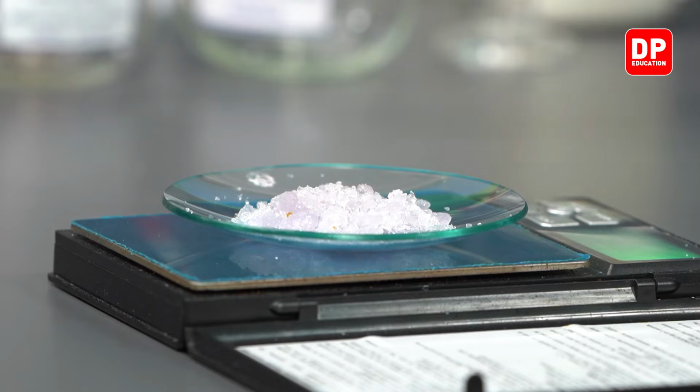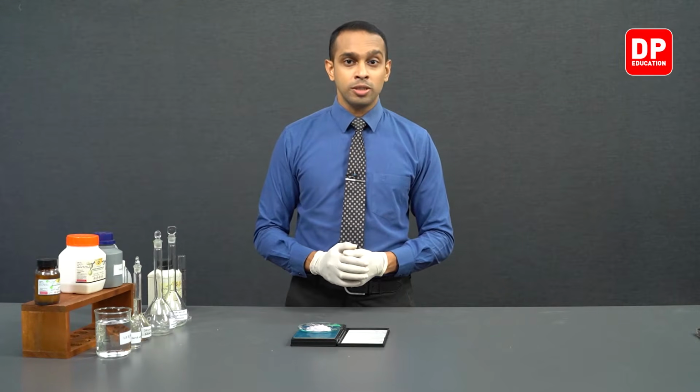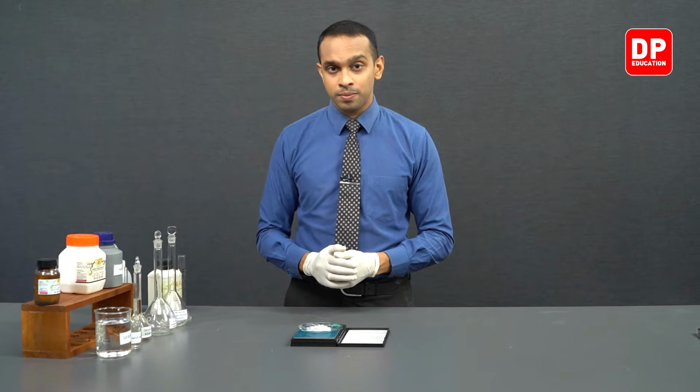So we are going to dissolve this ammonium ferric sulfate that we measured over here in 1 mole per decimeter cubed sulfuric acid.